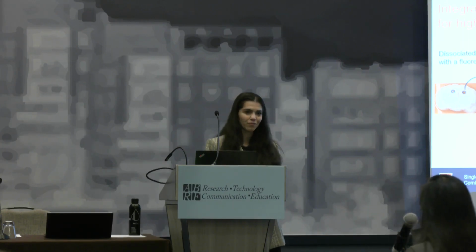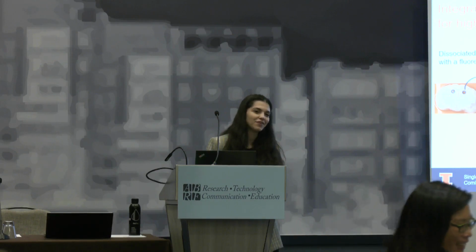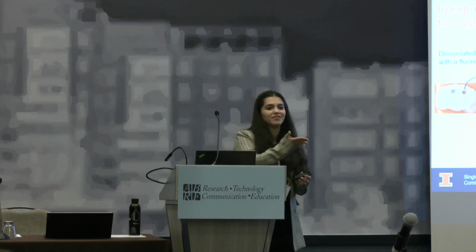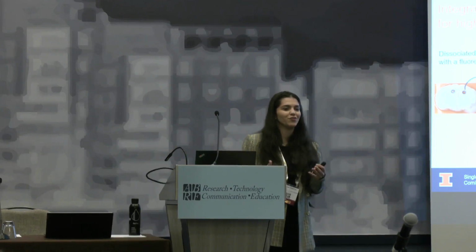How many plex can they go up to? I think they go up to maybe 70. You can do more. As long as you can see them in your m/z range, there's no limitation.